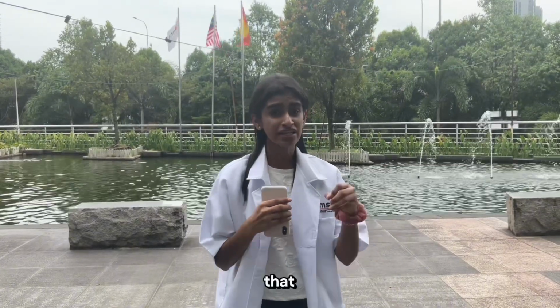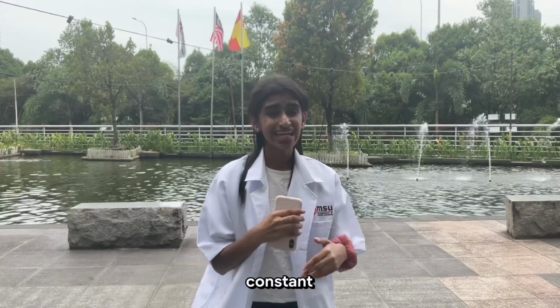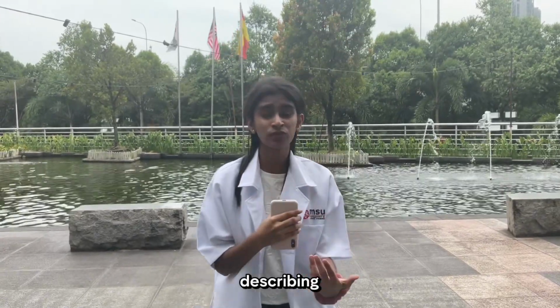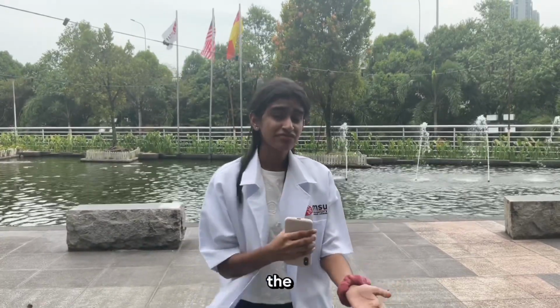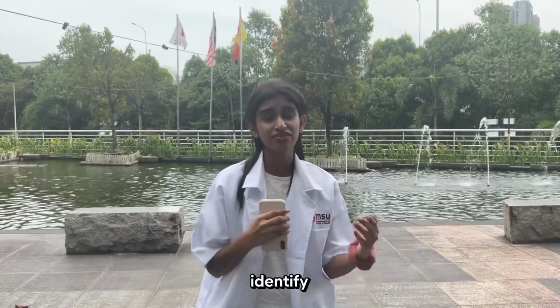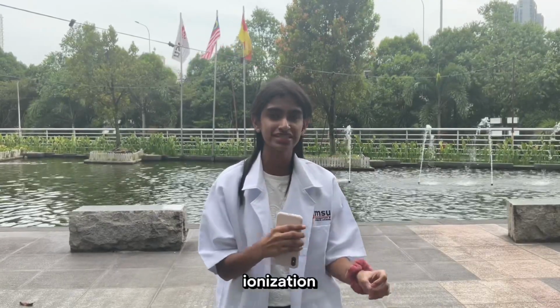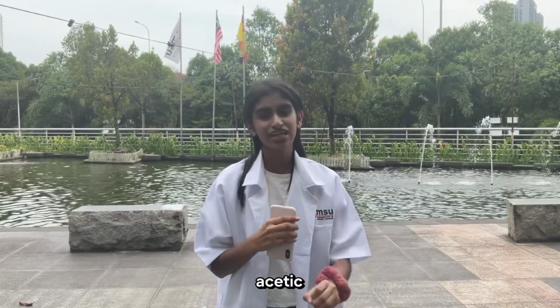Not only that, but it is also used to examine the equilibrium constant K and its role in describing chemical equilibrium. Last but not least, the experiment is also used to identify how the presence of an ion, which is acetate ion, affects the ionization of a weak acid, which is acetic acid, and modifies the pH of the solution.